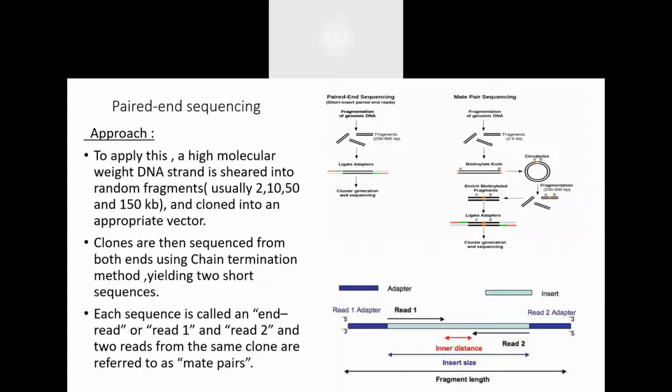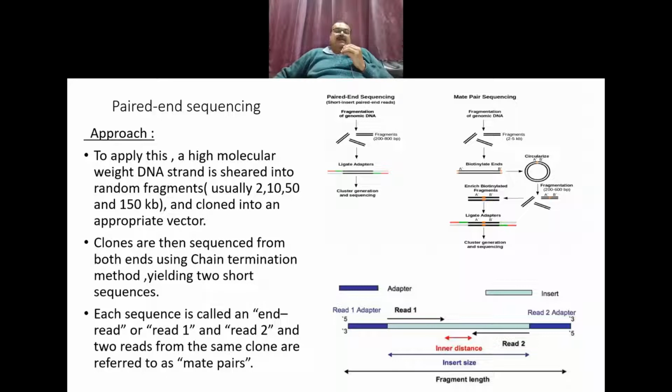Okay, thank you. These are basically oligonucleotide sequences, and most of these sequences are specific to the machine that you use. Like if you are using Illumina, Illumina will have its own adapters. For Illumina, you have multiple adapters available, like AmpliSeq, Nextera, and many others.